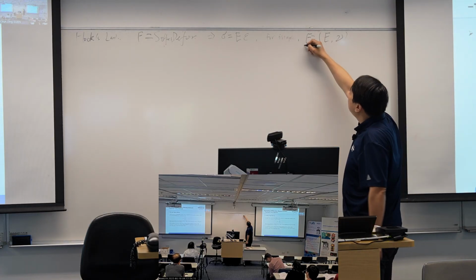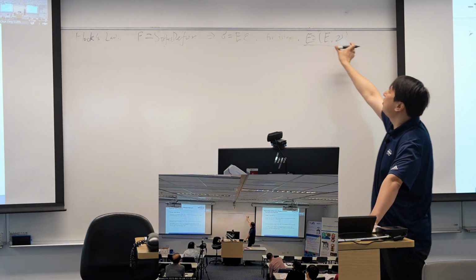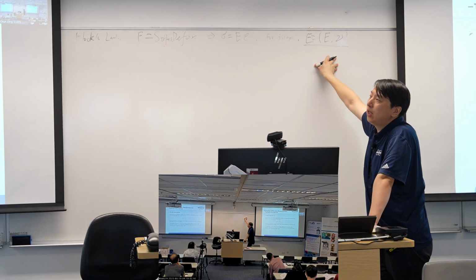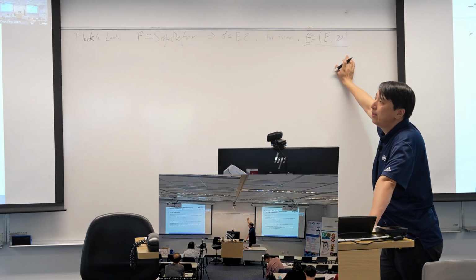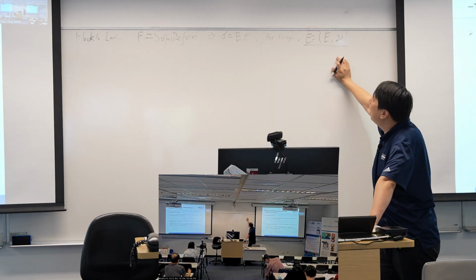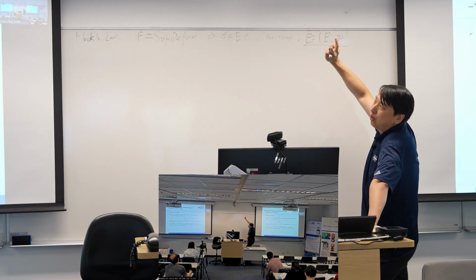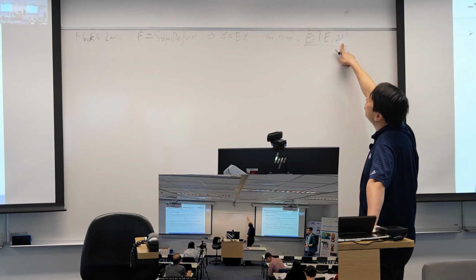And this is just one description, because we can use the concept in algebra. This is just a linearized space, and for isotropic materials, it only requires two bases. We can use modulus and the Poisson ratio.